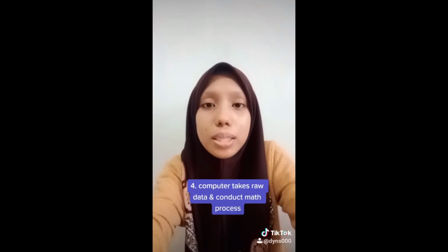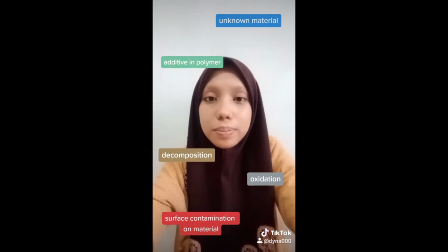The computer takes the raw absorption data and conducts a math process known as Fourier transform to generate a readable absorbance spectrum. This spectrum can then be compared to a library of spectra to find a match. It can be used to identify unknown material, additives in polymer, surface contamination in materials, oxidation, and decomposition.